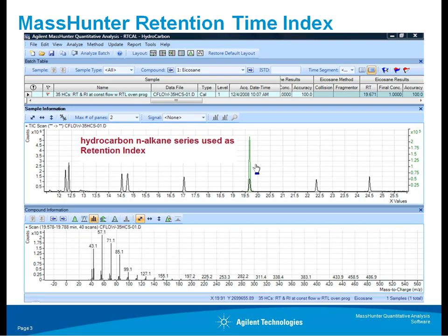So to answer that question, it's certainly worth mentioning you could employ retention time locking, and that works quite well if you have a fixed separation method. But in this, I will talk about retention indices and improving the identification using library search. So retention indices is basically creating a mapping that allows you to deal with retention time shifts. The classic example is a shorter column because you've just cut it. And that mapping, when we use retention indices, will allow us to correct for that shift.